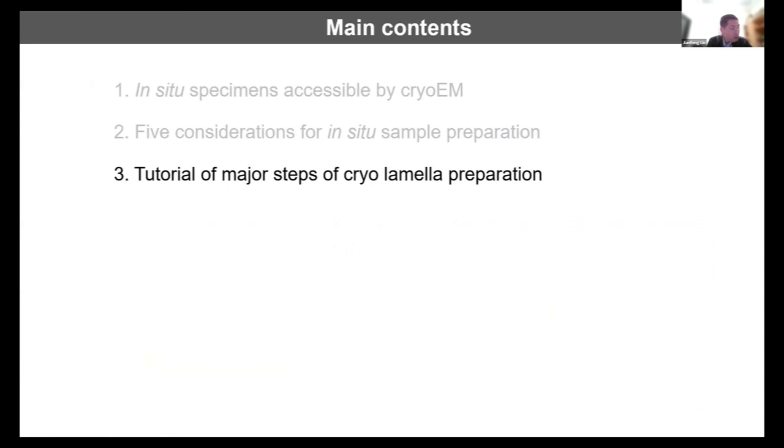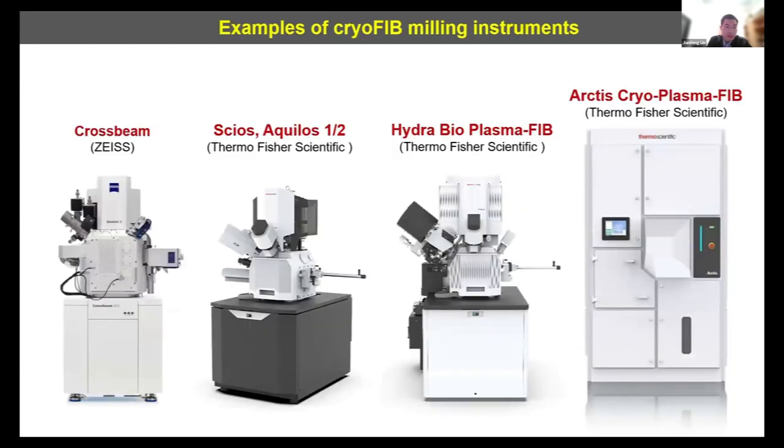In the following part, I will use around 1 hour to discuss the major steps of cryo-lamella preparation. Before we go into the third part, any questions so far? Okay, good. Because I don't know, every time if you cannot hear me or my internet is lost, feel free to just let me know. Okay, you got it.